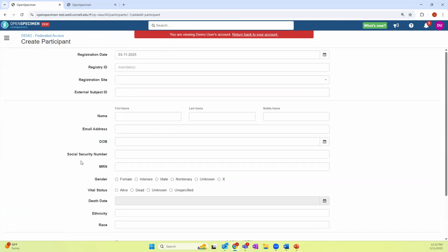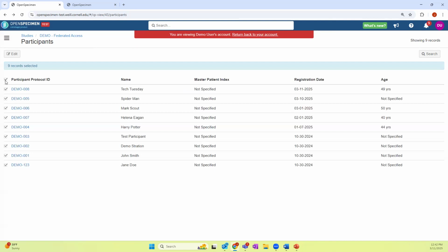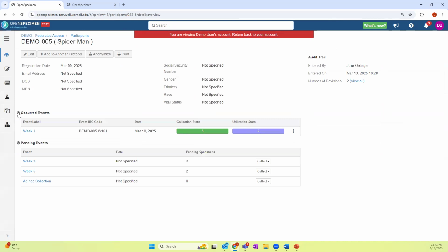And then there is also a secondary linkage that we have for surgical pathology reports. So if you are collaborating and collecting solid tissue specimens, there is the ability to pull in pathology reports, leveraging the accession number. So that is another available option if desired.